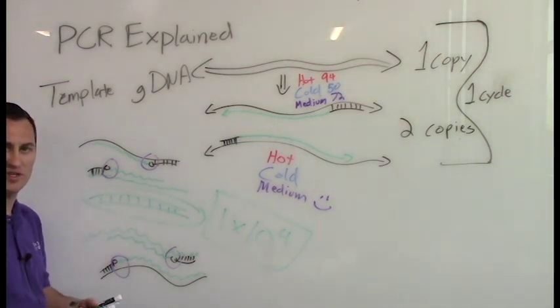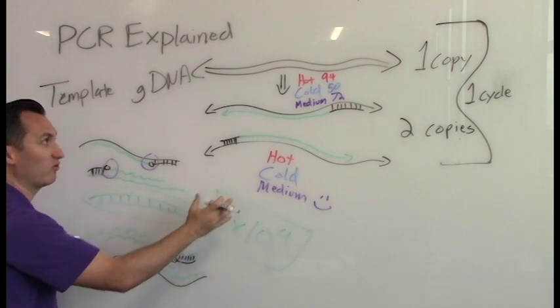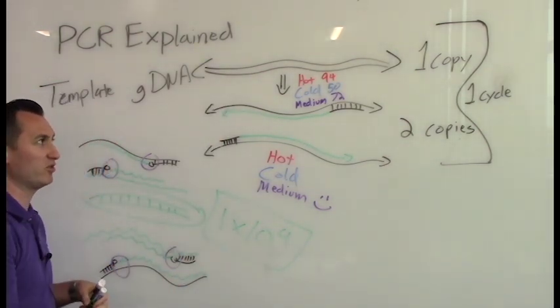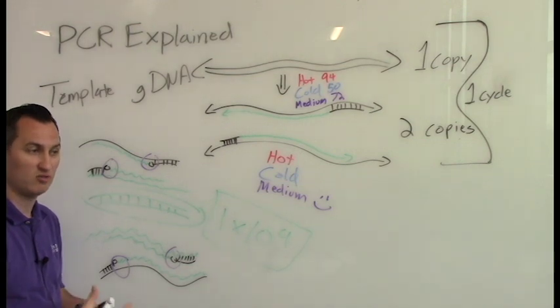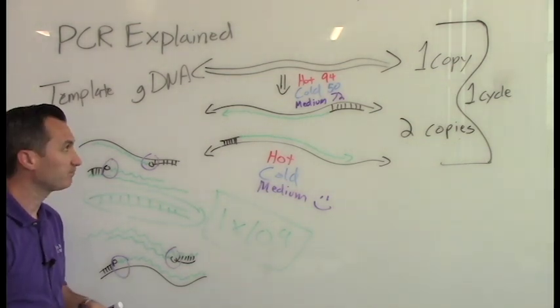I can study it a little bit easier because that signal has gotten really big, and it's gotten so big that it greatly outnumbers the genomic DNA, the large pieces of DNA that were there before, and I could use a DNA gel perhaps to separate out those smaller fragments and do something more specifically with those. That's a very useful tool in biology.